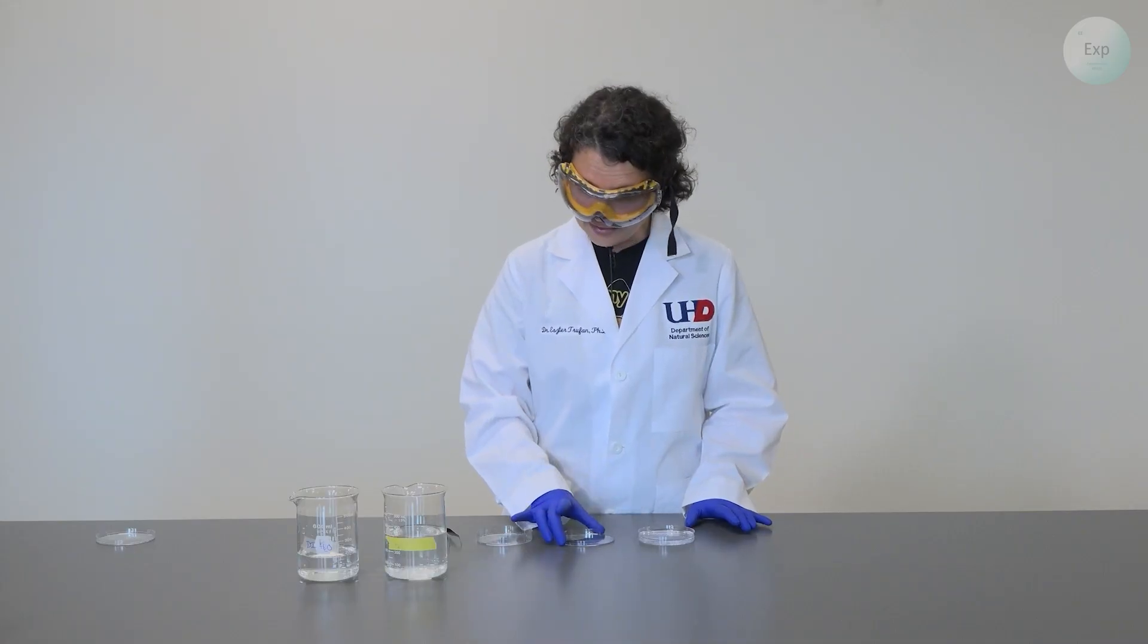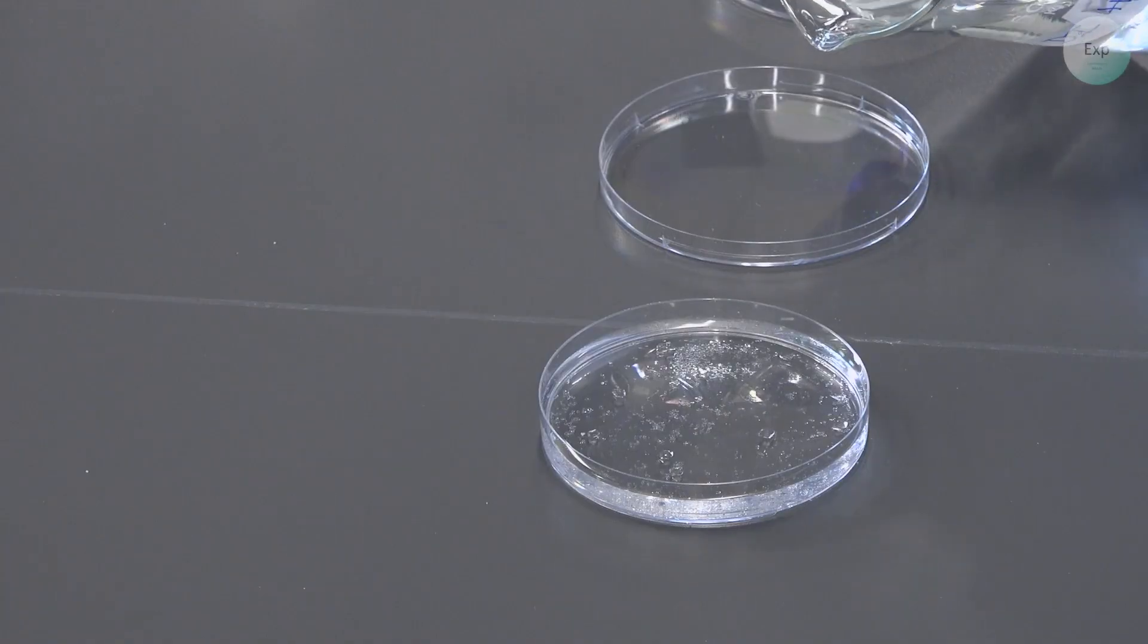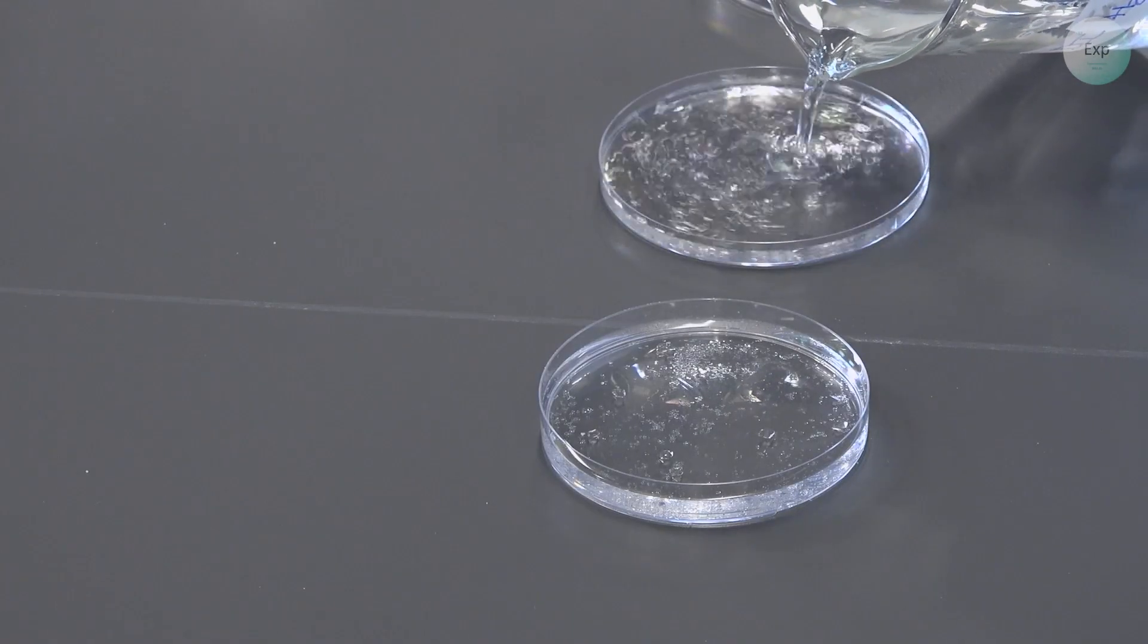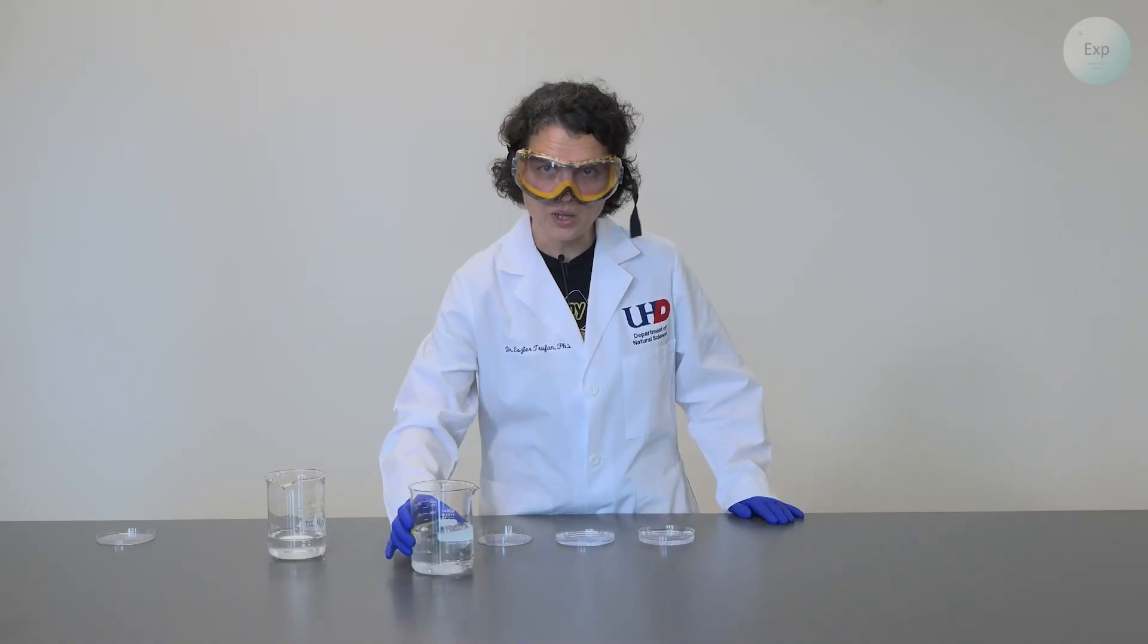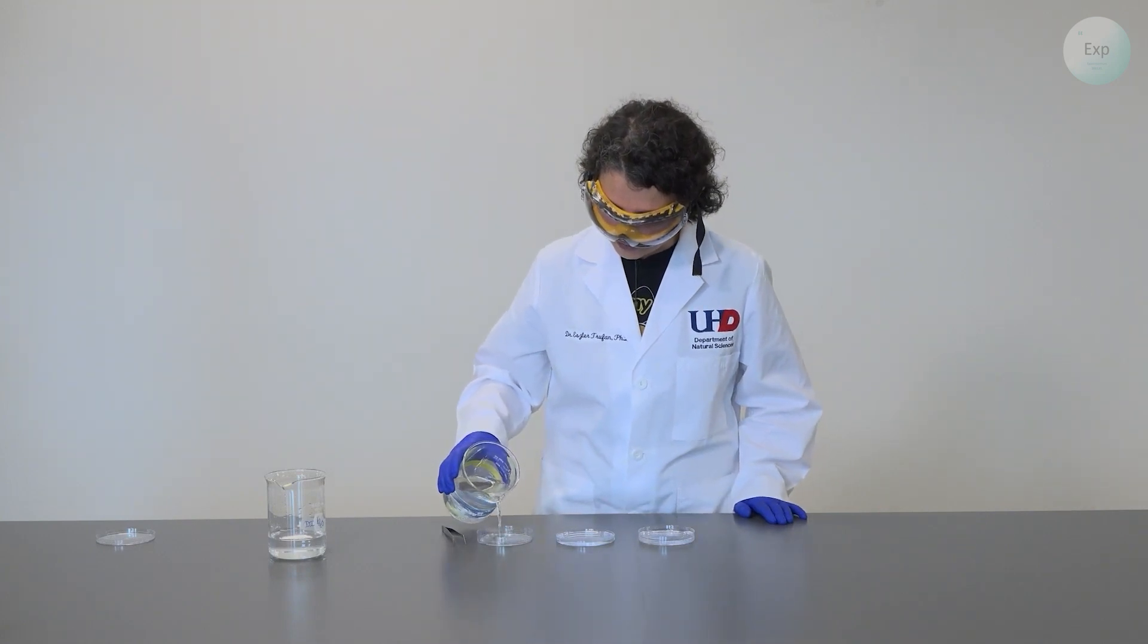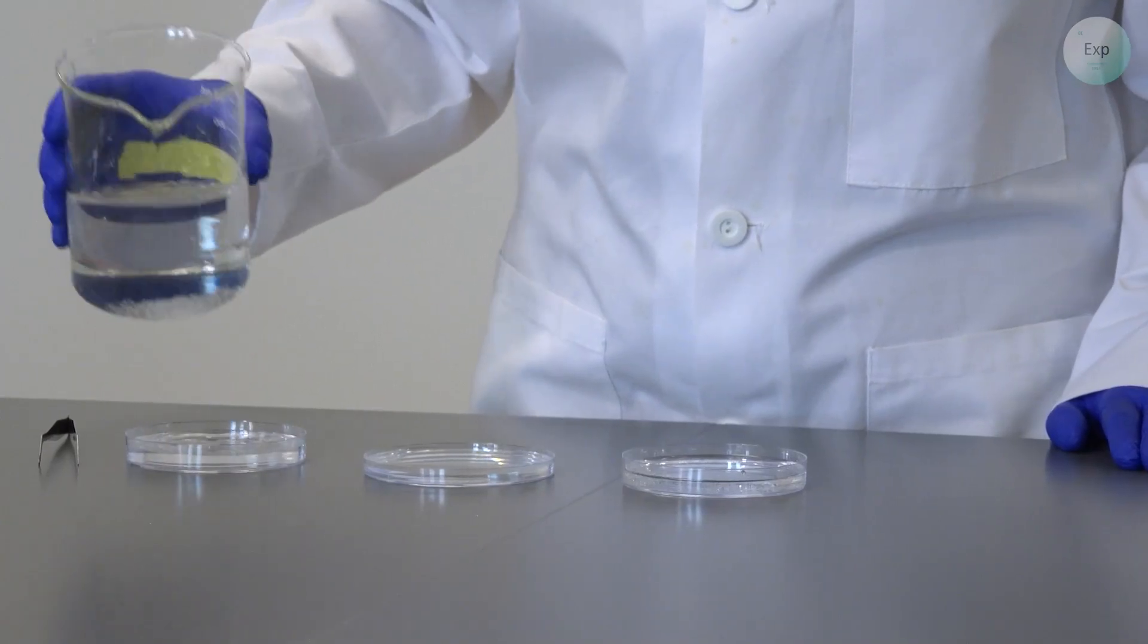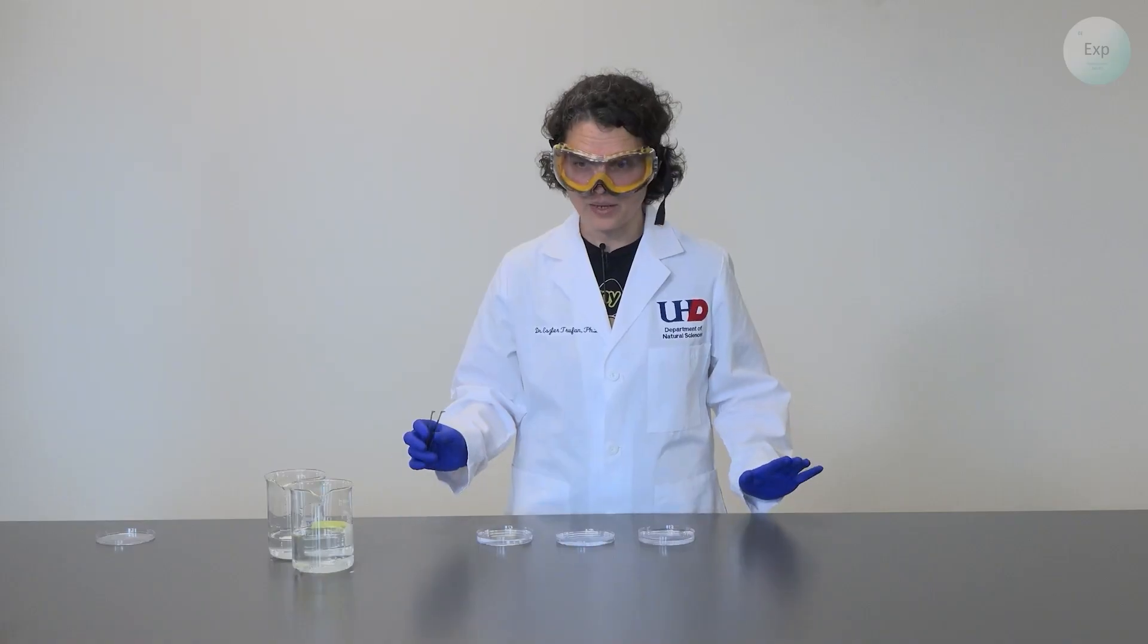In the lid of my second petri dish, I will pour a small amount of water so that it covers the bottom completely. This will help me rinse my solution. And then in the base of my second petri dish, I will pour some of my saturated alum solution. And now I am ready.